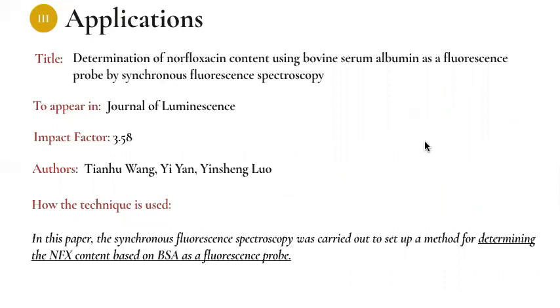The last study is entitled as follows. This appears in Journal of Luminescence with an impact factor of 3.58. So for the background of the study, norfloxacin has a wide application in human and veterinary medicine because of its antimicrobial activity and excellent pharmacokinetic features.